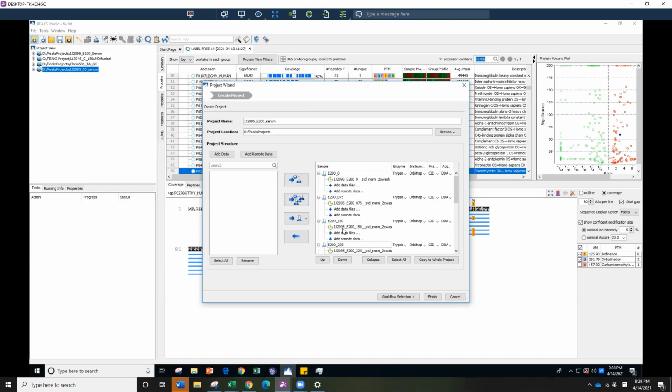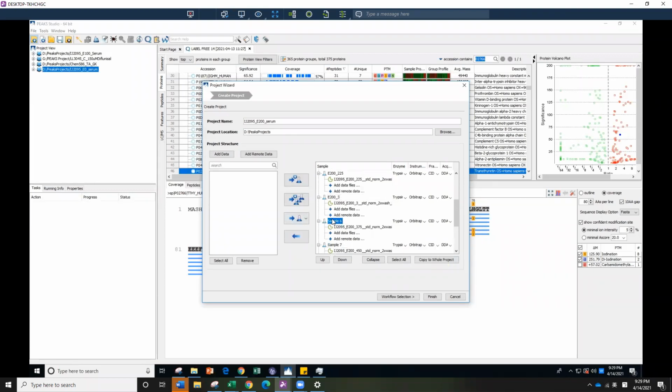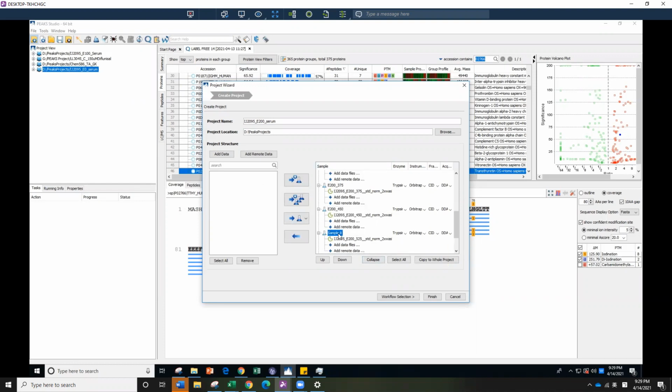This one will be the header of your columns, for your sample columns. So you don't want it to be extremely long, but you also want it to be differentiable. Especially if you have multiple Excel files open, you don't want to mess up your sample conditions between runs. So having it clear is definitely helpful.